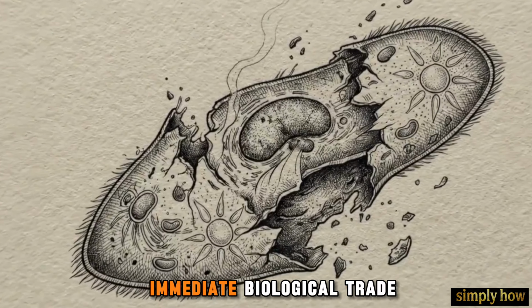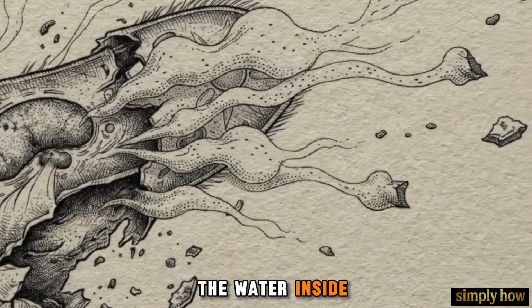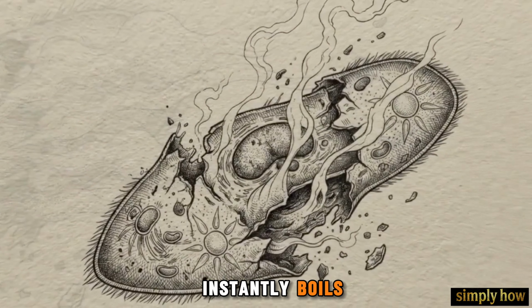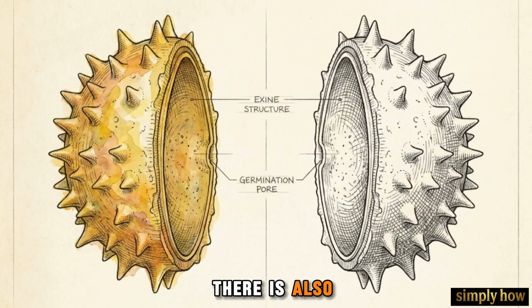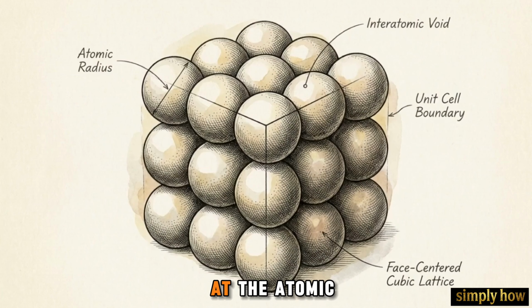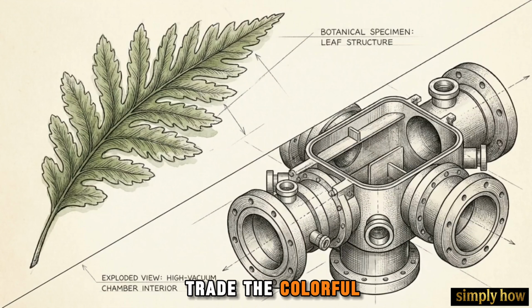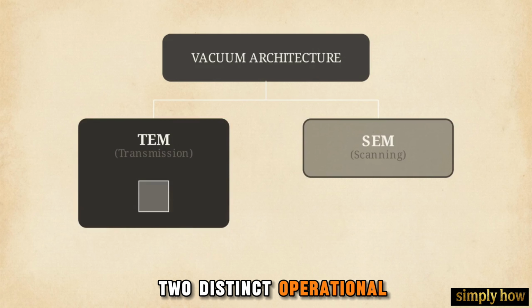This creates an immediate biological trade-off. Under an ultra-high vacuum, the water inside a living cell instantly boils. You cannot keep an organism alive through the observation process. There is also an optical trade-off. Electrons do not carry color data. The final output you receive is a strictly grayscale map. To view reality at the atomic level, you have to trade the colorful, living, ambient world for a dead grayscale vacuum. Within that vacuum, researchers generally choose between two distinct operational architectures.